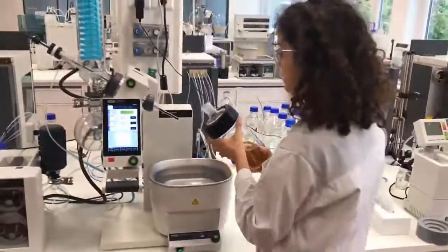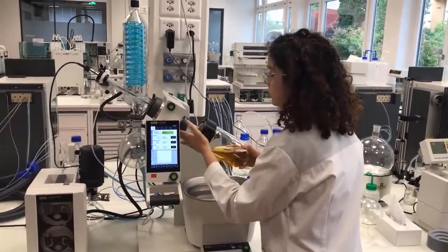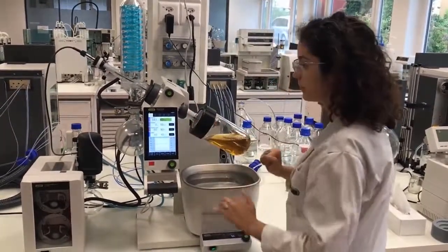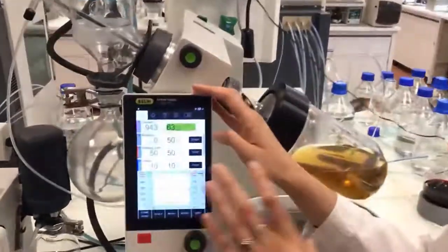I will put my flask now onto the reservoir. Make sure that here it's quite tight. Don't go all the way, but make sure it's a bit tight. So now we're going to come a bit closer to the interface so that you can see how this works.